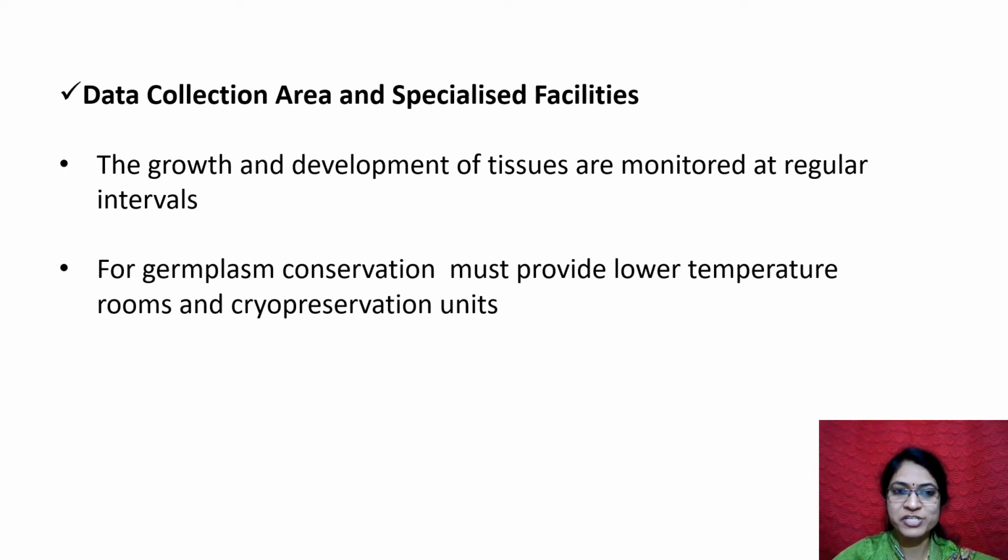All this information must be noted down, and after transferring the culture tubes into the growth chamber or culture room, we must note down the date of the inoculation.